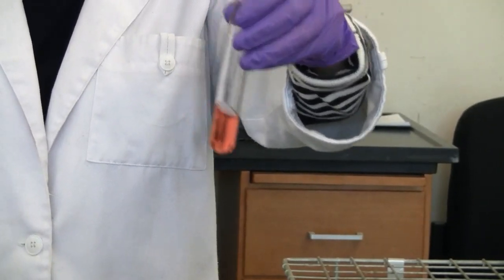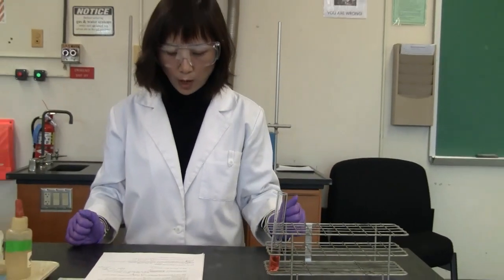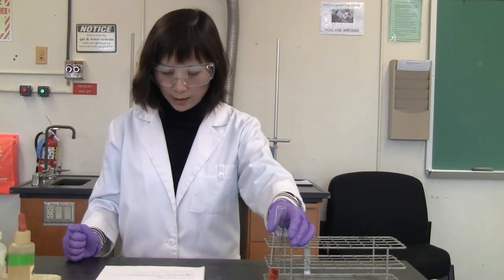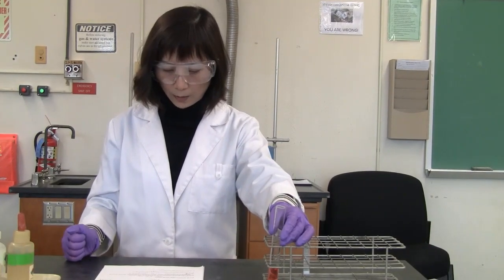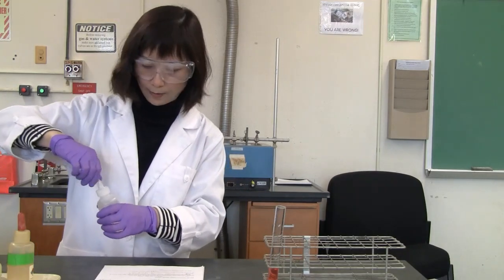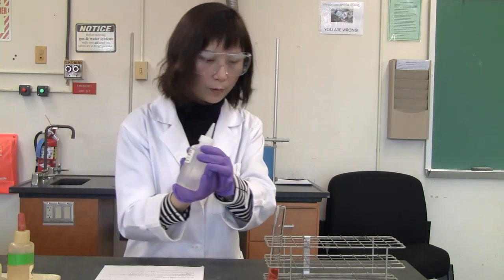Now move to step 3. I'm going to add several drops of the 0.1 molar sodium acetate to the test tube. Sodium acetate. Several drops.